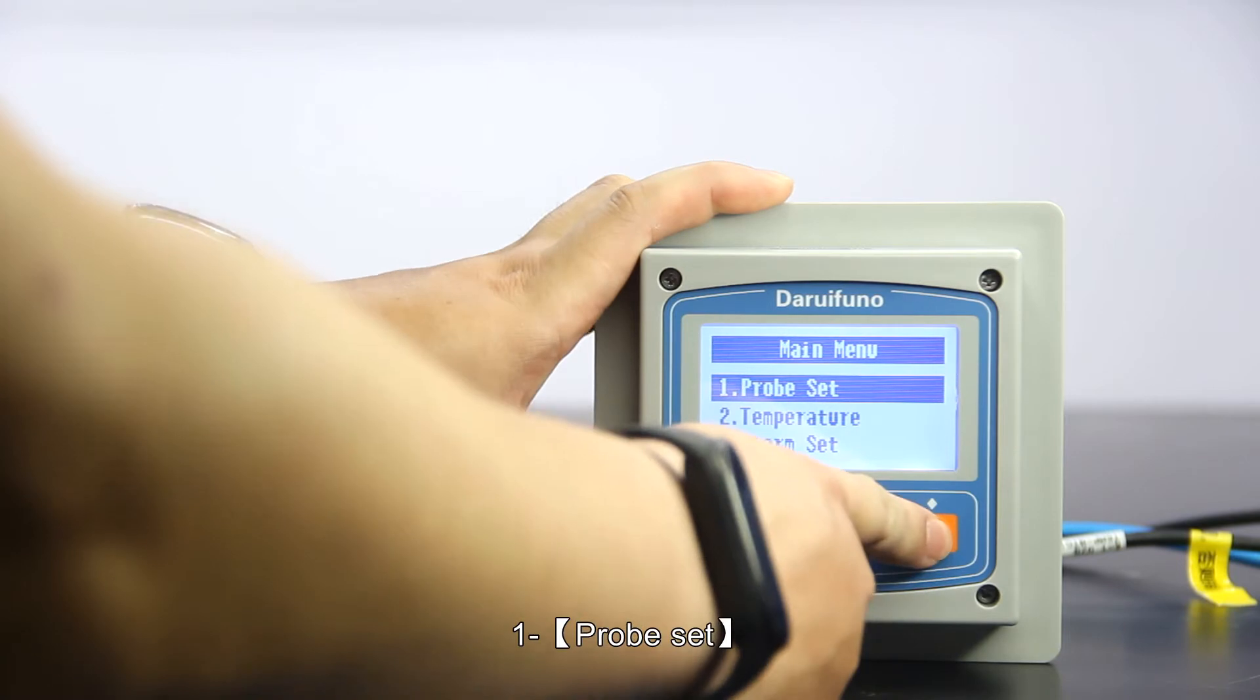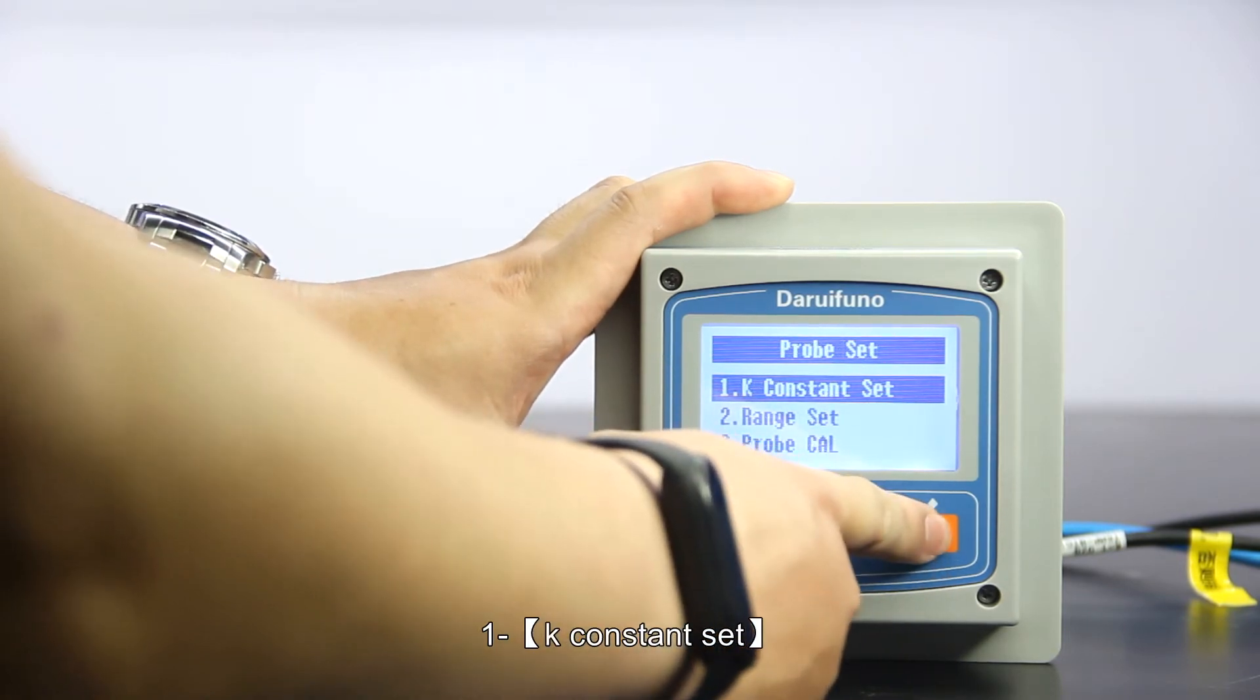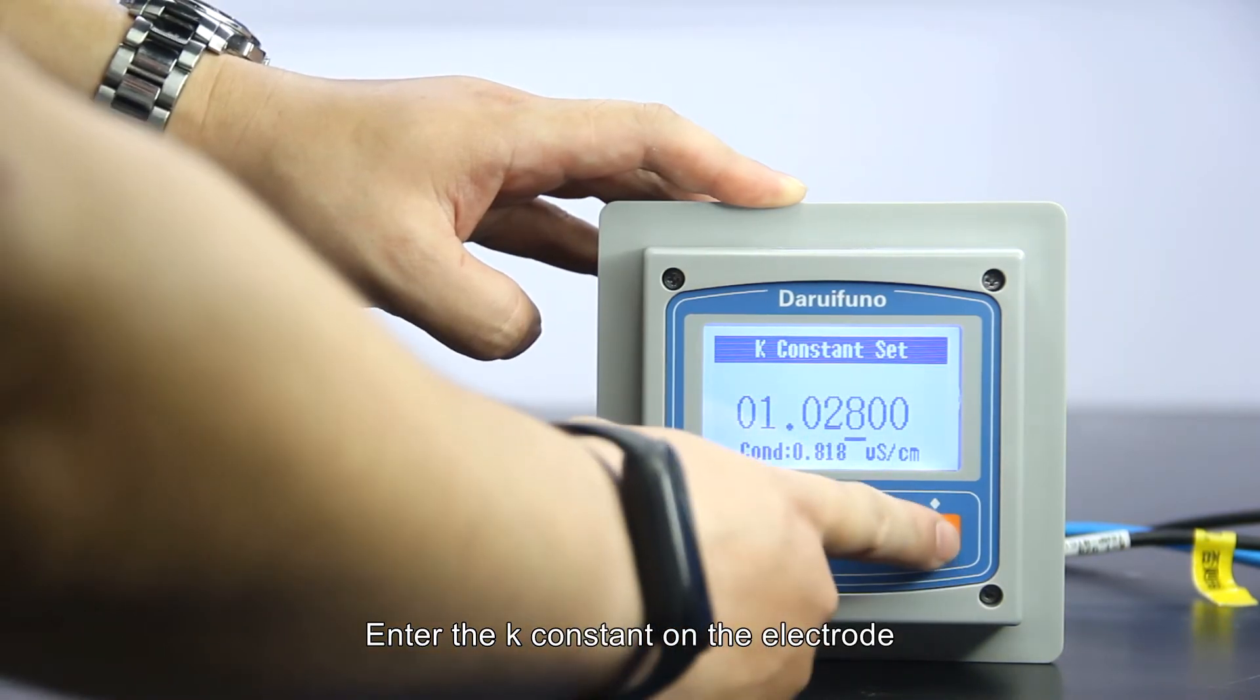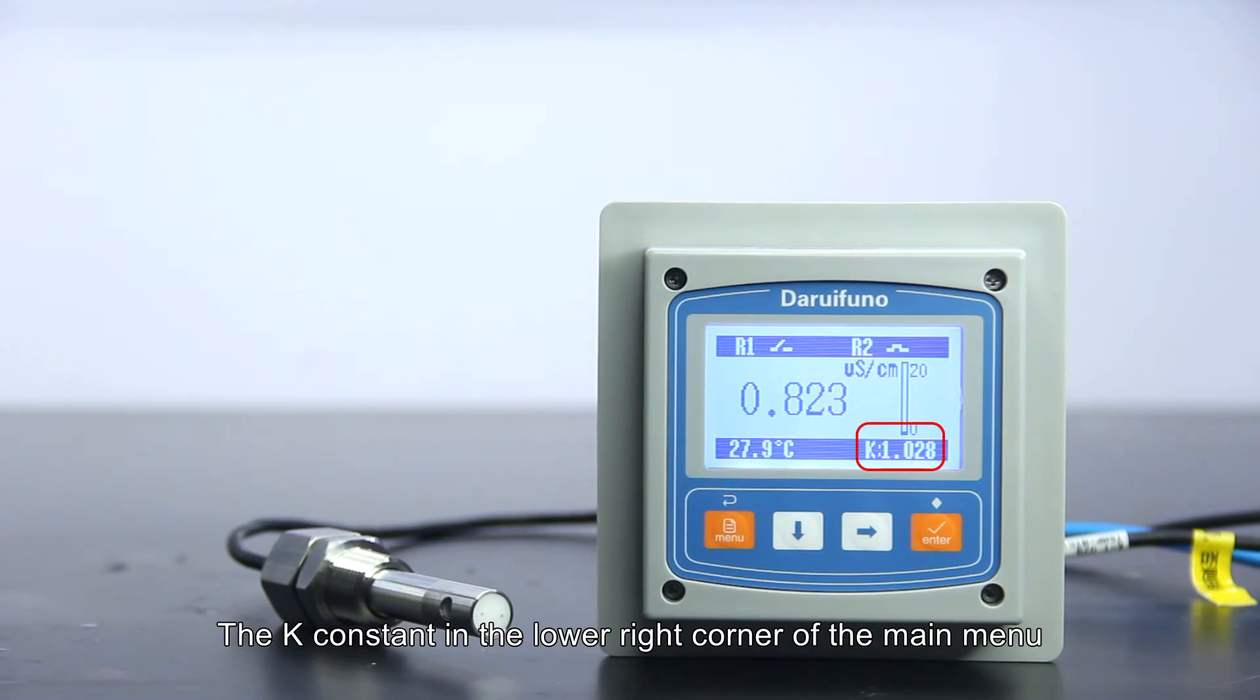Long press the menu key to enter. Select probe set, then K constant set. Enter the K constant on the electrode. The K constant in the lower right corner of the main menu will be replaced with the value you set.